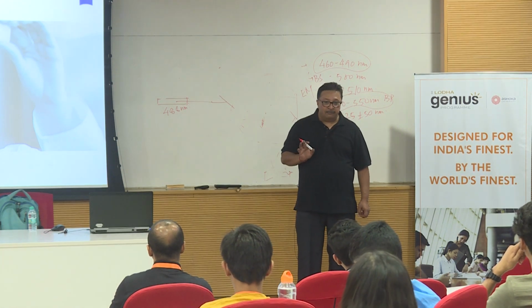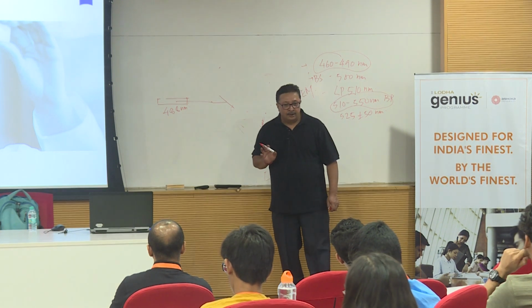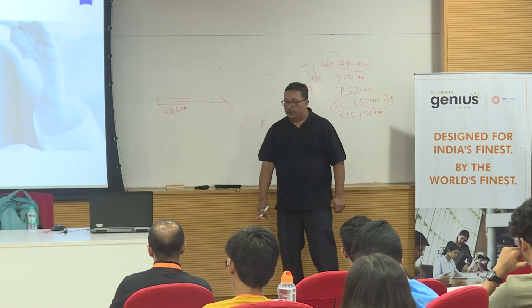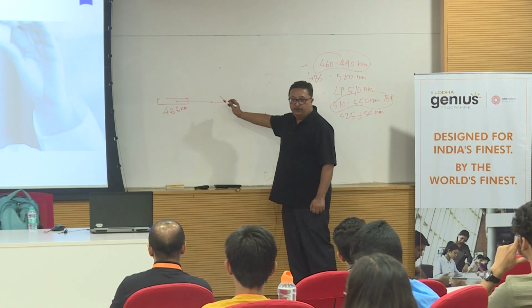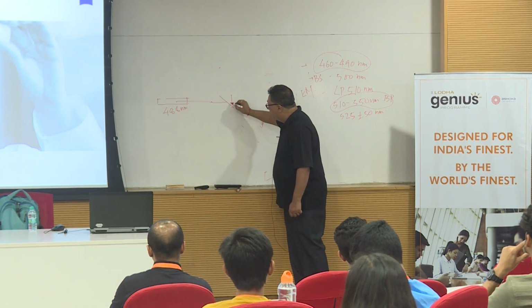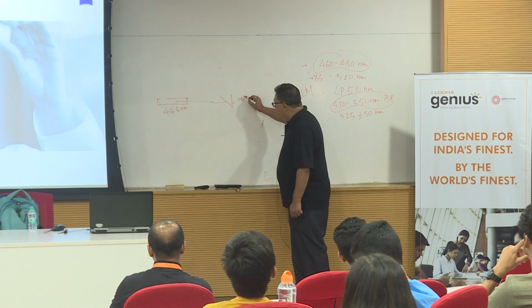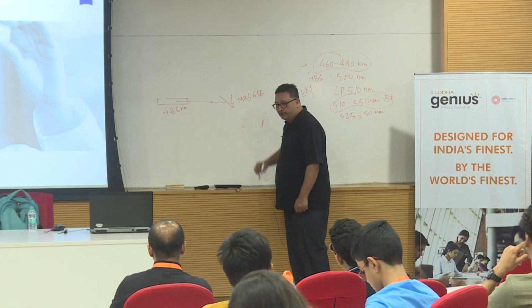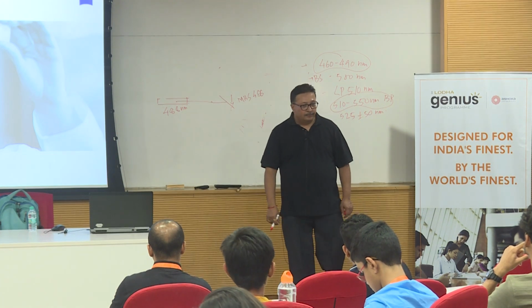What is the next thing that was there in the fluorescence microscope? Inclined mirror, dichroic or the beam splitter. So the first component that will come onto a confocal is your beam splitter, or what you call as a nomenclature we say MBS, main beam splitter, for instance. Clear?